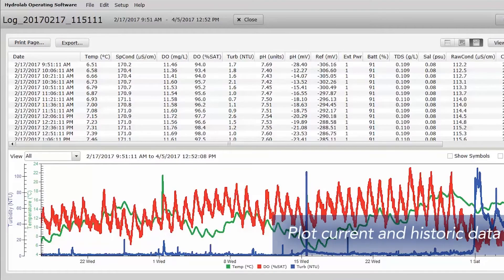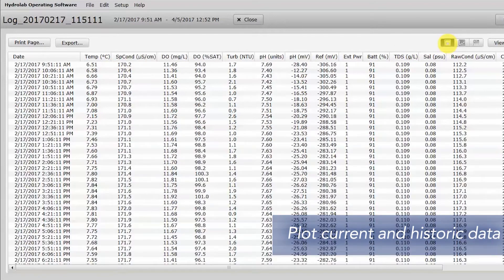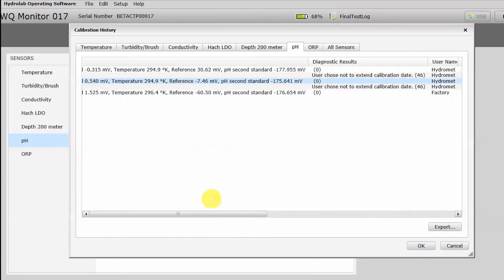Plot current and historic data with multiple graph and table formats. The calibration history provides traceability and helps boost confidence in your results.